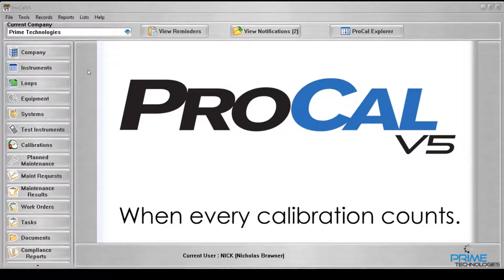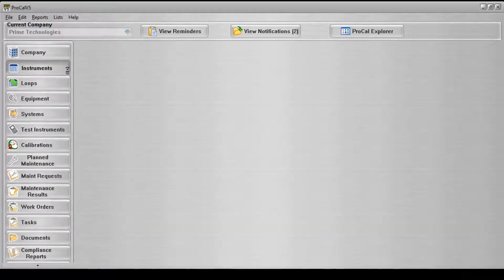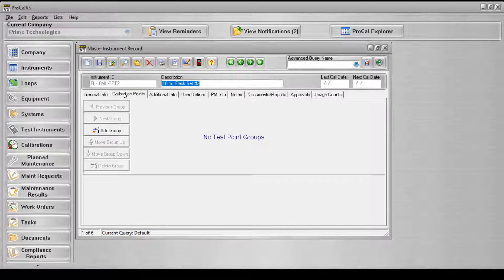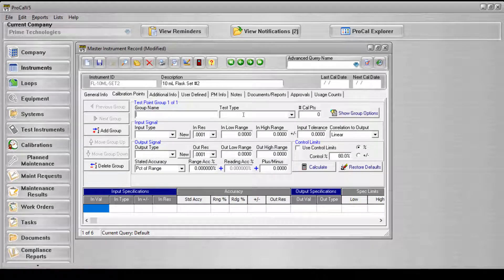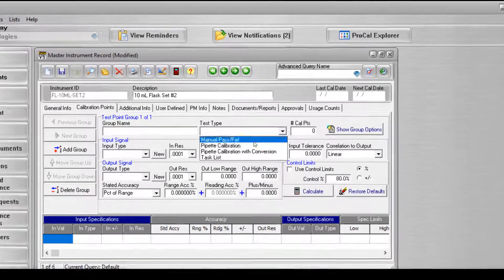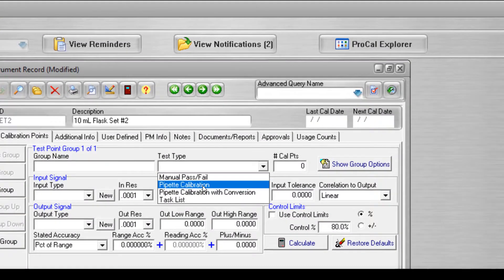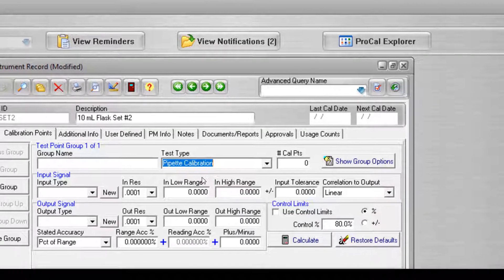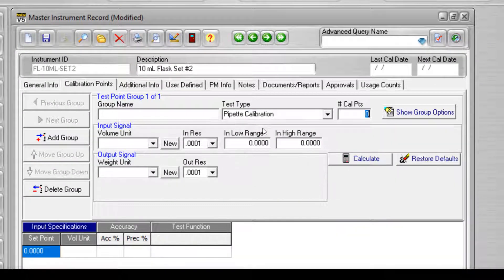When creating a new master record that uses the pipette test type package, the test type must be applied to the record through the calibration points tab on the master record screen. Once a new group has been added to the record, click the test type drop-down list and select Pipette Calibration from the available test types. After the pipette test type has been selected, the field names will change according to the settings defined by the file.